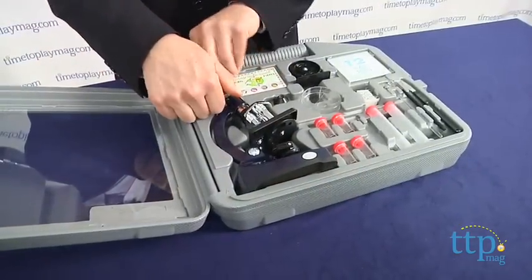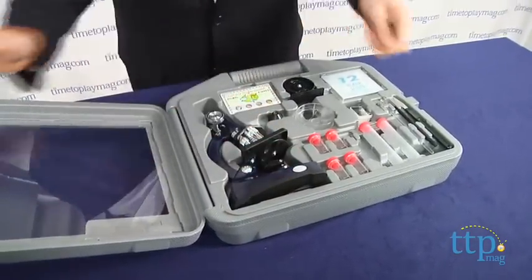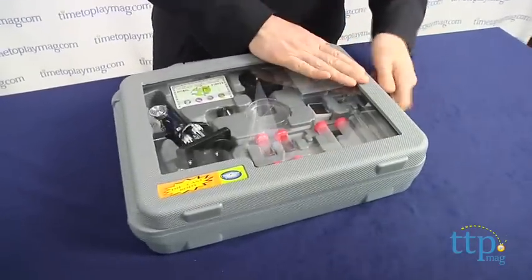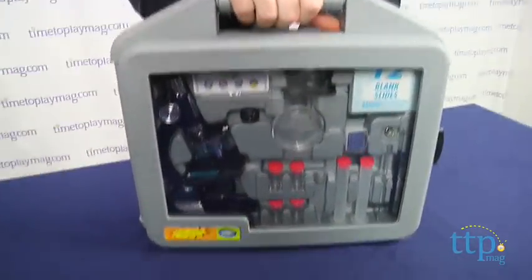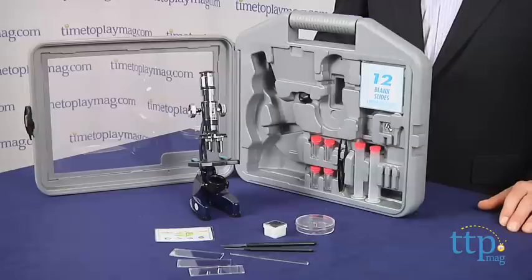The instruction manual has important information on the care and use of the microscope, as well as an introduction to the microscopic world around them. After that, though, kids are on their own, and the fun and discovery is all up to them.